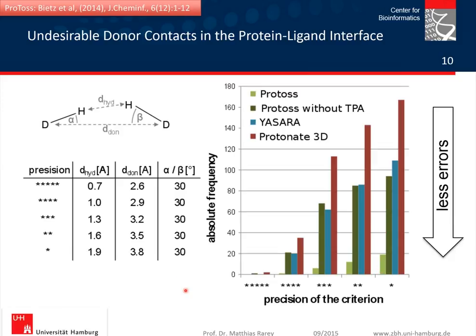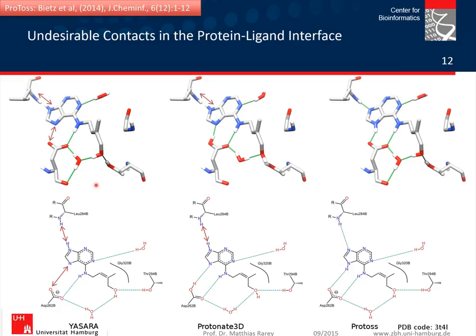All right, again, just a few pictures so that this gets more real to you. Here is a quite difficult scenario where you can see the problems which occur. You see this aromatic heterocycle. You see in the first solution two mistakes. You have the donor-donor clash over here. You have an acceptor pairing over here where the hydrogen is missing. And this is clearly because for this ring system, a different tautomeric form was chosen.